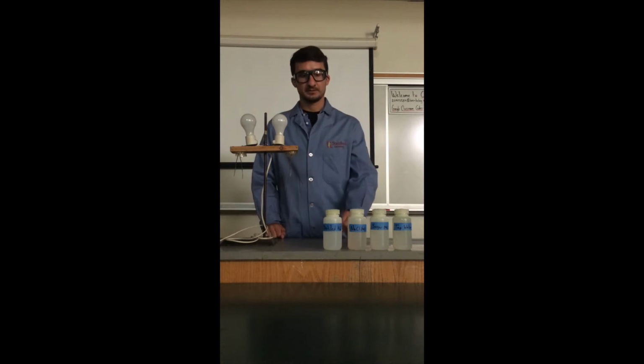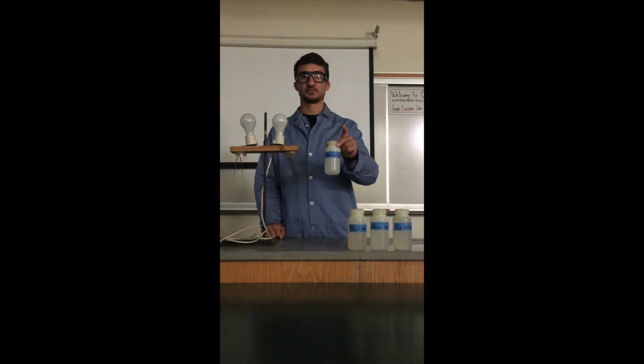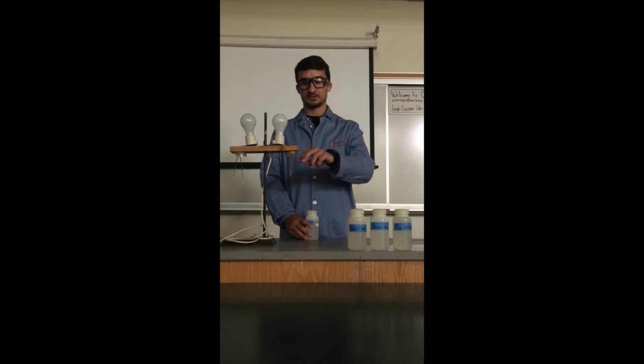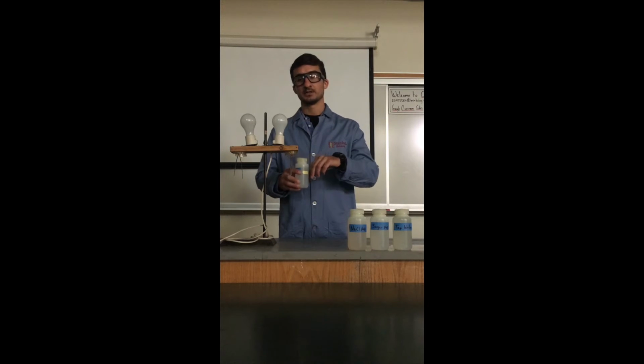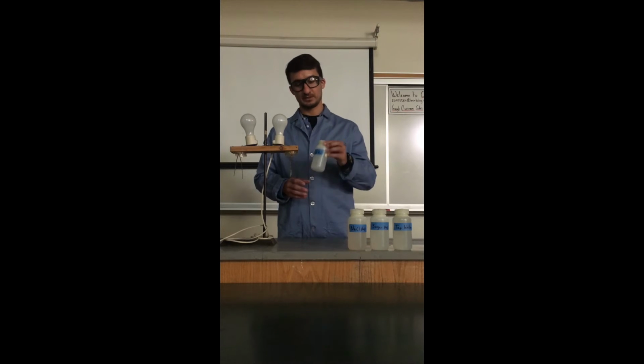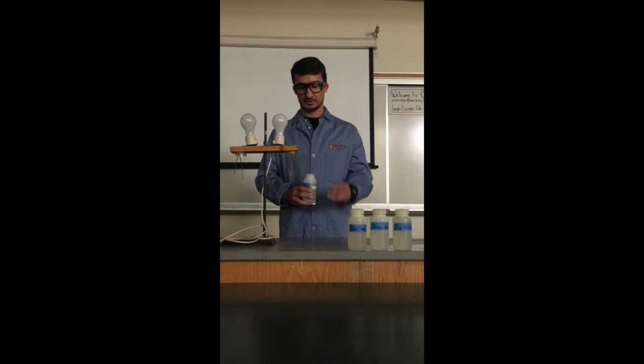So I want you to make a prediction. First one we're doing here, this is distilled water. Distilled water is just pure water, H2O. So predict, do you think that the pure water will conduct electric current or not? If you think it will conduct electric current, then when the wires are placed into the water, the light bulb will light up. The circuit will close, electricity will be flowing through the solution, and the light bulb will light up. If the distilled water does not conduct electric current, then the light bulb will remain not lit up, not illuminated. All right, so make sure your predictions are written down.